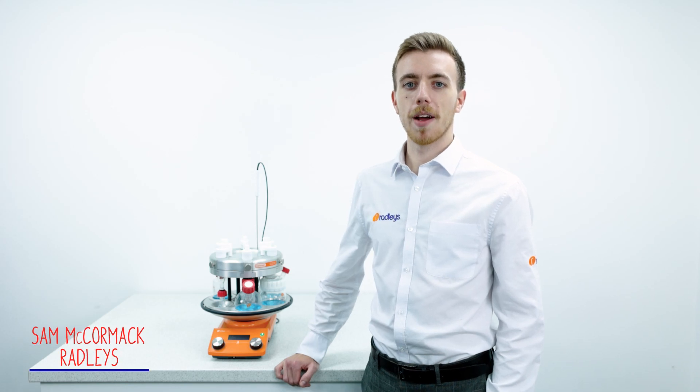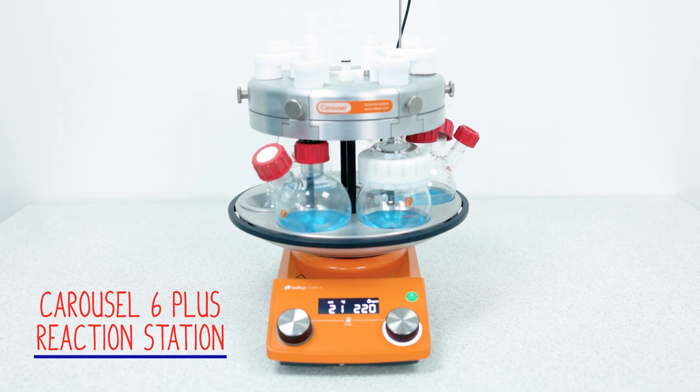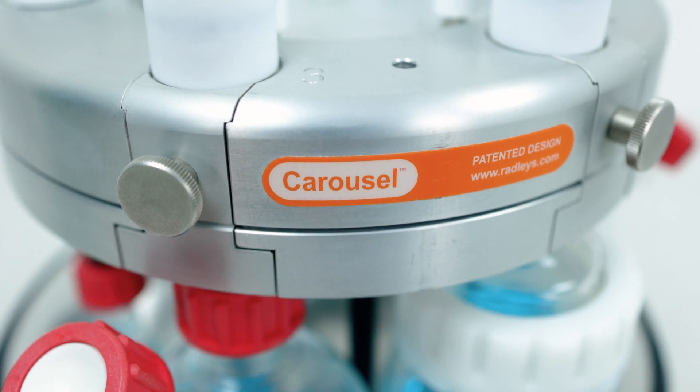Hi, I'm Sam, part of the team here at Radley's, and I'm going to show you the Carousel 6 Plus parallel reaction station. The Carousel 6 allows you to heat and magnetically stir up to six reactions simultaneously at various scales.